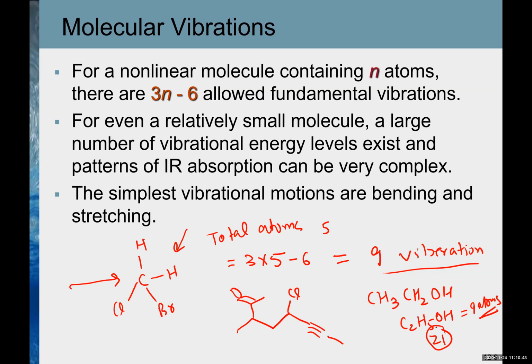So the point here is interpretation of all those peaks and all those valleys and vibrations is impossible. So we cannot interpret this structure correctly from infrared spectroscopy. But we do get extremely important information, and that information in combination with other spectroscopy data such as from NMR and from mass spec is enough to analyze and elucidate the structure of the molecule.